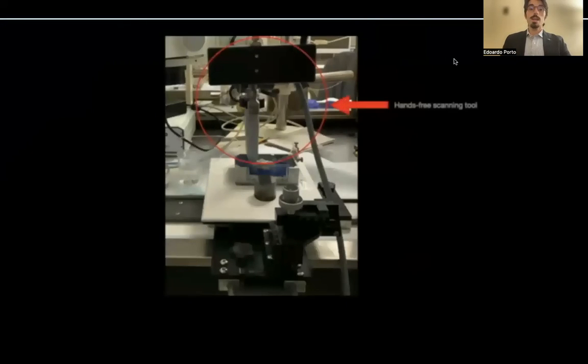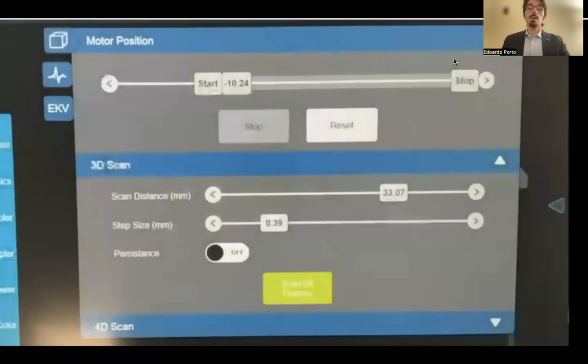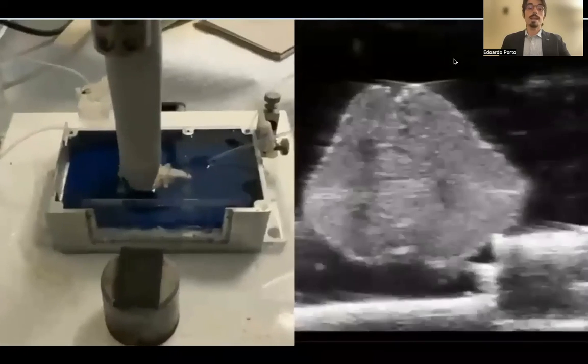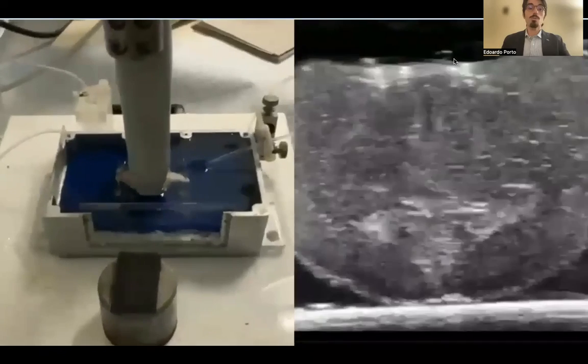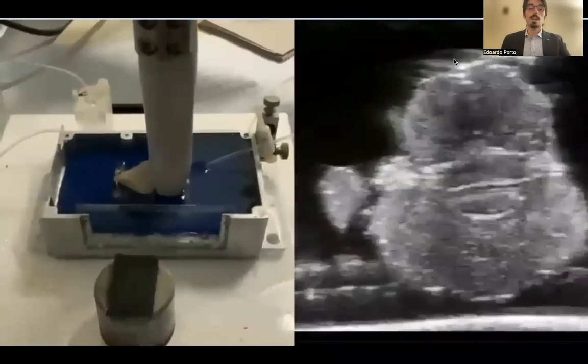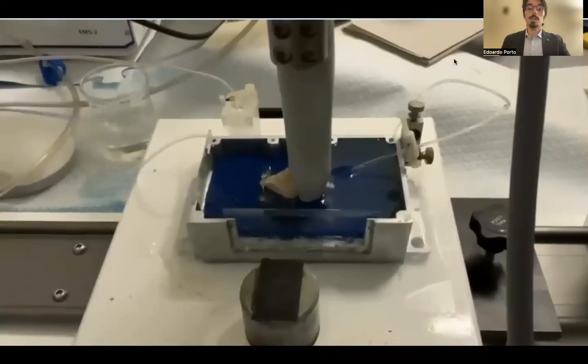In this project, we used 3 guinea pig brains and the Vevo station and the Vevo 3100 scanner, which is an ultra high frequency ultrasound scanner with the relative probe, which can be placed over our specimen and automatically slide over the isolated guinea pig brain at a preset speed.